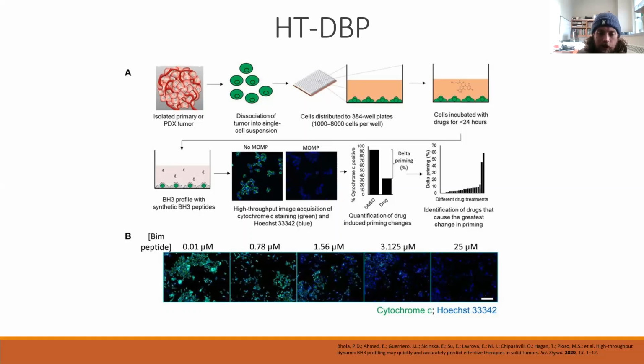Yeah. I don't have the whole protocol here with me, but they claim to be able to analyze thousands of drugs in a relatively short amount of time, and so they definitely have to have some sort of efficient, normalized, or standardized way of doing it, especially at the imaging and quantification stage, because it can take me weeks to do image analysis on IF. Right? Yeah, same.